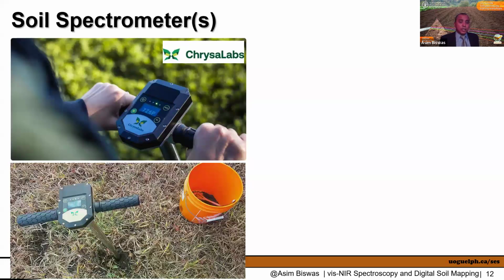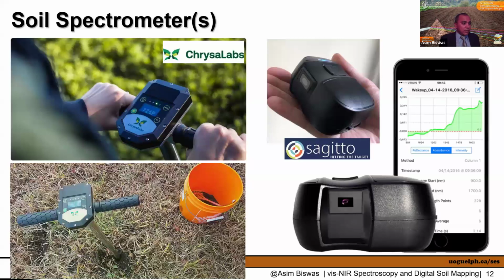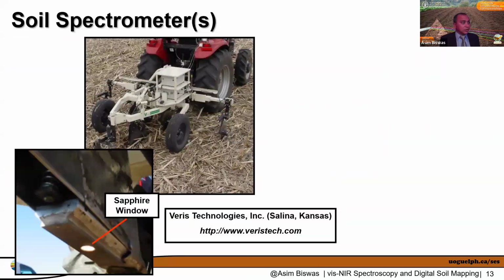You can take the spectrometer out in the field with one click of a button. You can get some of the measurements as well, the GLOSOLAN, or even much smaller, on top of your palm. You can take that, and it's quite a range as well, 900 to 1700 nanometers in the IR band. You can see the spectral reflectance for the soil as well.